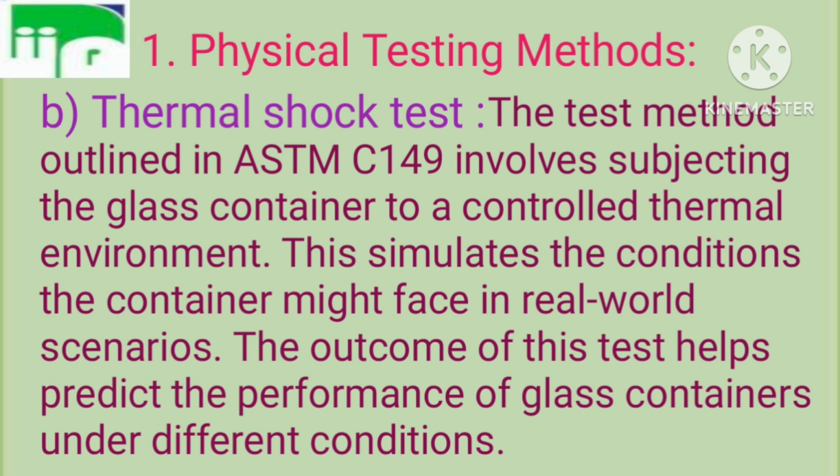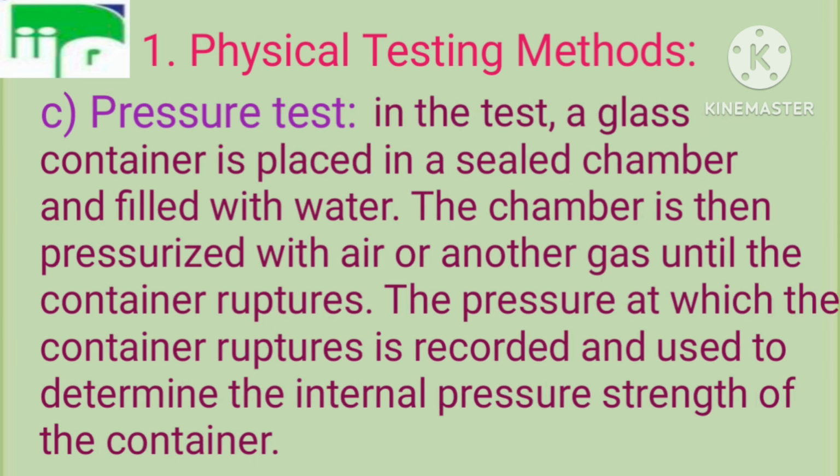Next is pressure test. In this test, a glass container is placed in a sealed chamber and filled with water. The chamber is then pressurized with air or another gas until the container ruptures. The pressure at which the container ruptures is recorded and used to determine the internal pressure strength of the container.